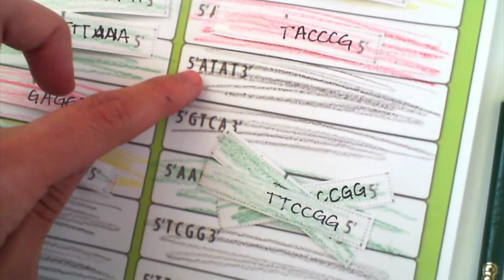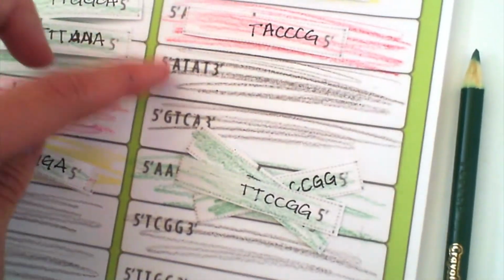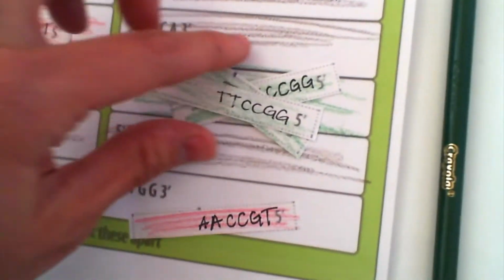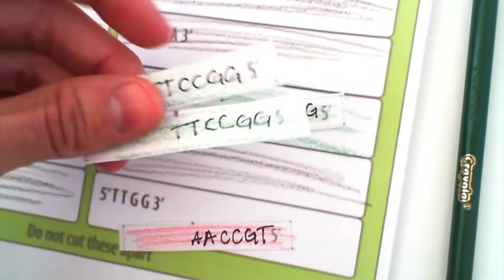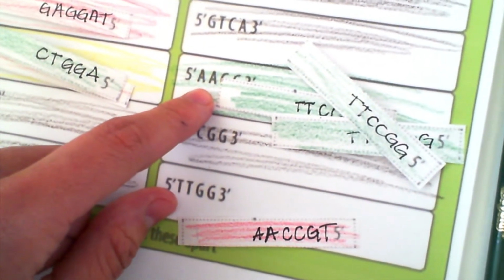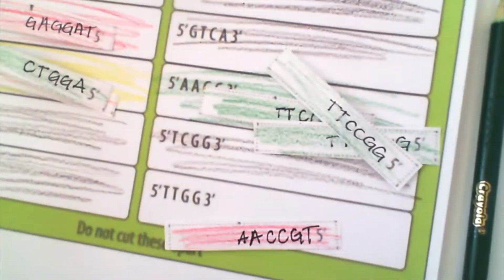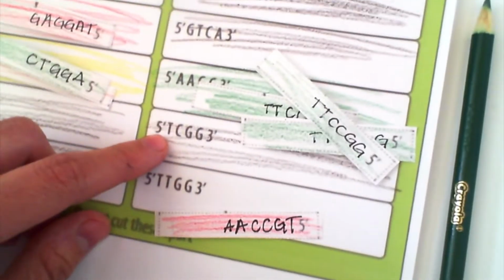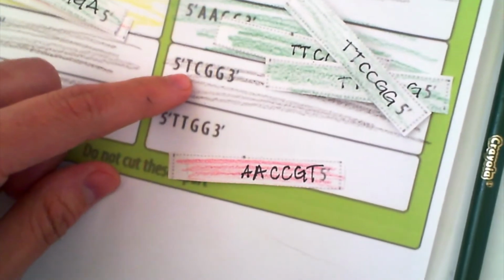Black, no gene, not expressed. Black, not expressed. And then this one right here that contains 3 cDNAs from the plant that was given sunlight. So that means that in this gene, whatever it corresponds to, it is expressed as normal. And then again, this one right here, black, meaning that it is not expressed in both plants.